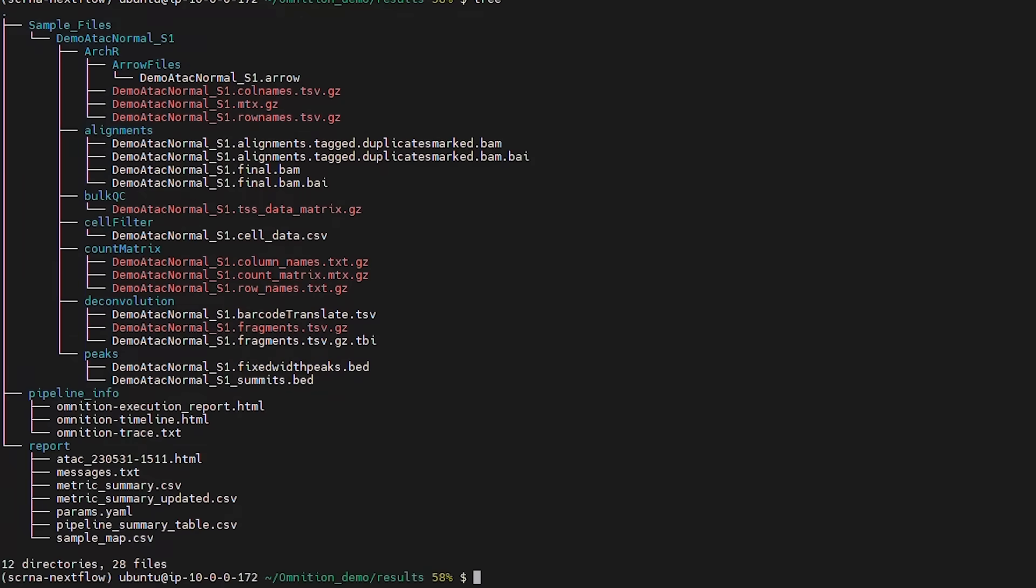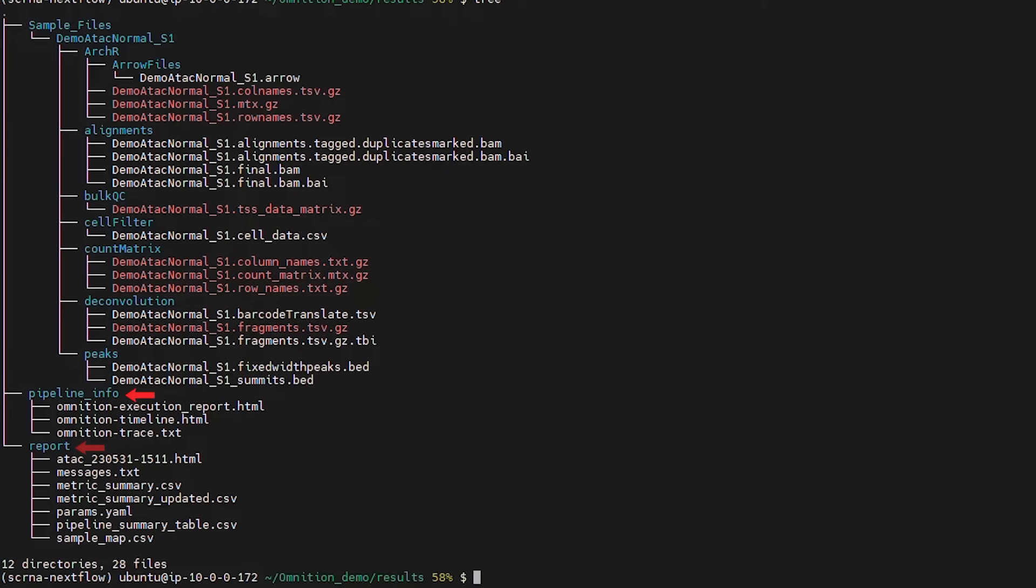In the Pipeline Info folder, you will find information about the Omnition pipeline including a record of the previous screen as well as a more detailed record of the different steps Omnition performed on your samples.